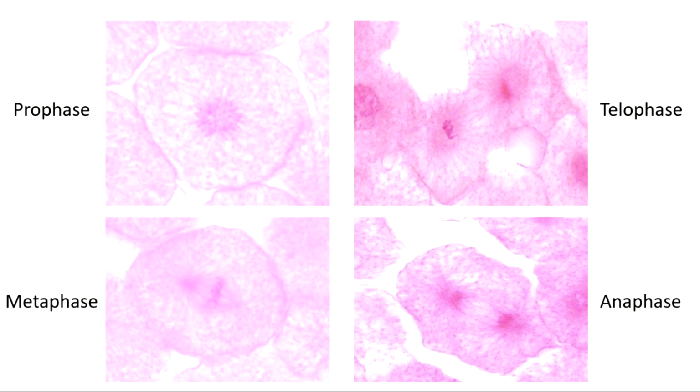So see this line, this divot right here, and this divot right here? This cell is pinching in on itself. So its plasma membrane is squeezing down from both sides to squeeze it off, to detach it from each other. So I am in the process of telophase now. My genetic information is completely divided. I know that because cytokinesis is happening. It won't happen until our genetic information is divided.